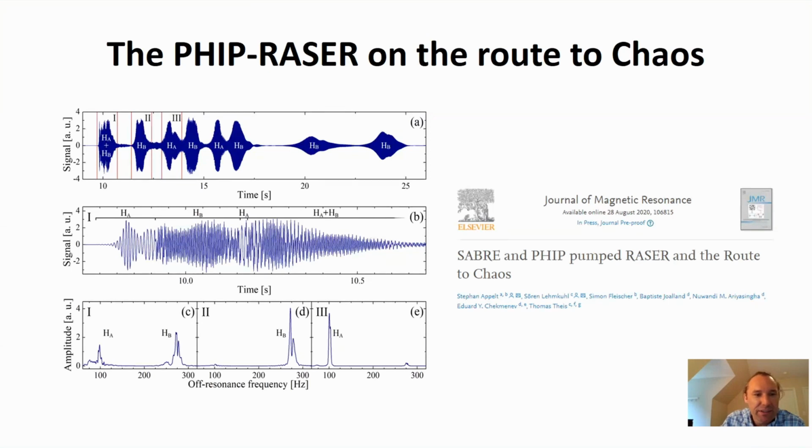And then you have things that are usually associated with the topics of chaos and intermittence. For example, the detected spins change randomly between being the one spin and then the other. You can even see that in the FID. For example, when you look in B, you can see how the frequency starts out regularly, then suddenly becomes faster, then goes slower again, and then becomes faster again. So it's interesting to enter this world of chaos and intermittence theory.